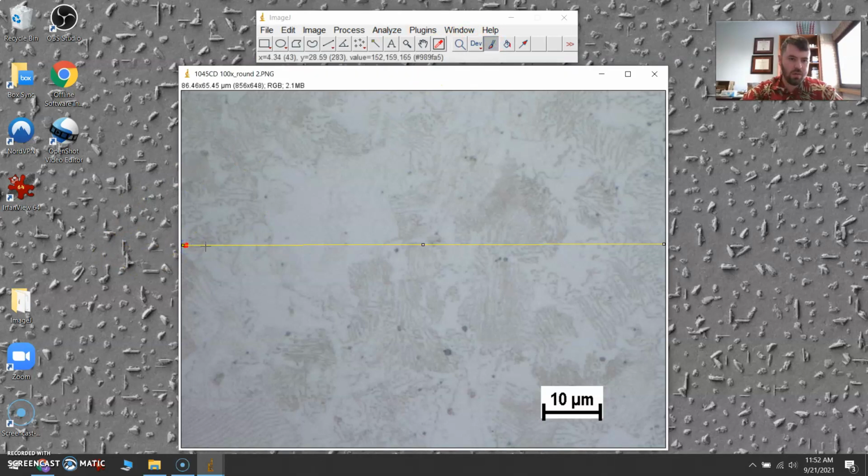So we have 1, we have 2, 3, 4. I'm going to say this is one region, 5, 6, 7, 8, 9, 10, 11, 12.